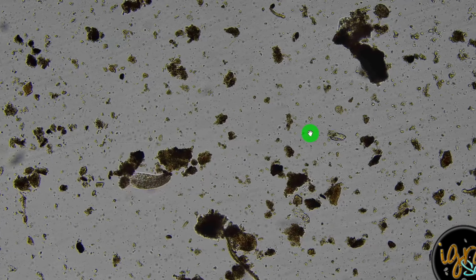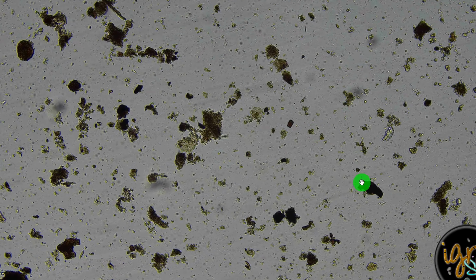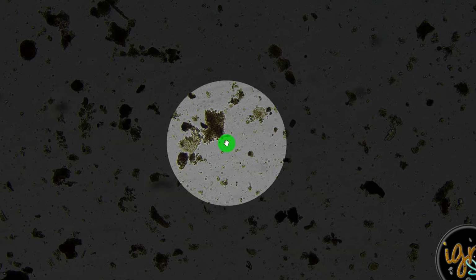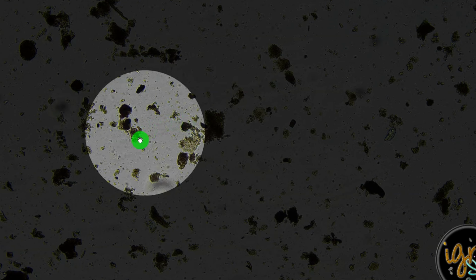You're extremely humic, meaning the humic and fulvic acid content, and you can see them here, and carbon. So again, the darker stuff is going to be more carbonous. The chocolate colored light brown and dark brown, the light brown is fulvic acids. The darker brown is humic acids, which is all part of this carbon chain, and how it's able to transfer biology.